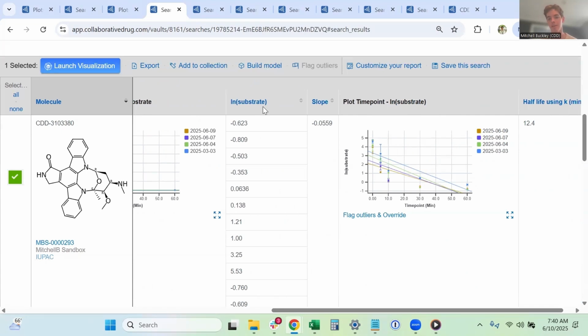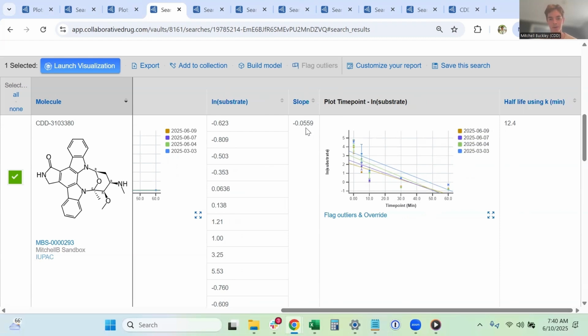And then I've used a second curve fit, our linear fit, to fit that log transformed data here versus time. Now, the great thing about this is that I can then use our auto-calculated slope value in our half-life calculation. And really, in this example, we've stitched together a few different curve fits, a few different custom calculations, and it's very representative of the power of the curves module itself.